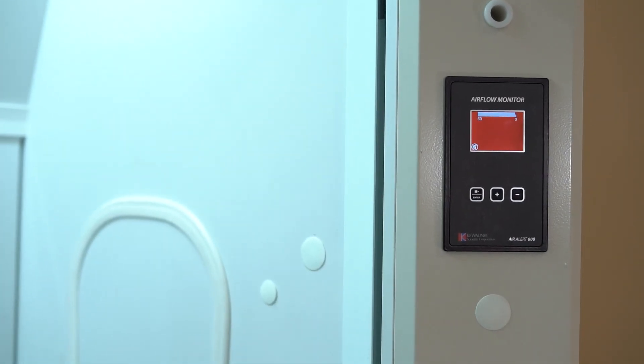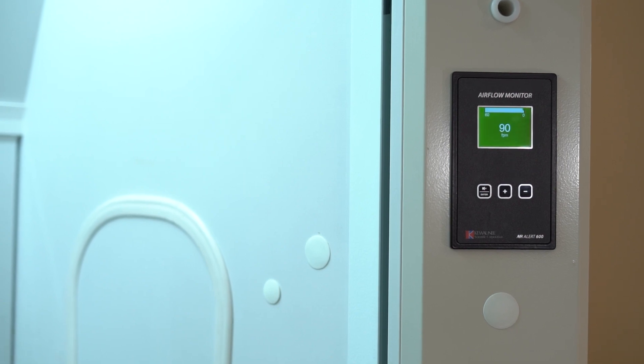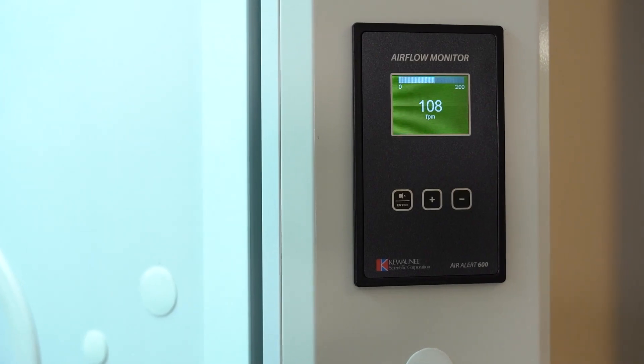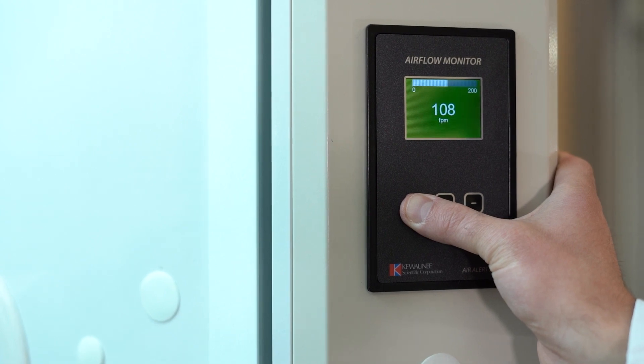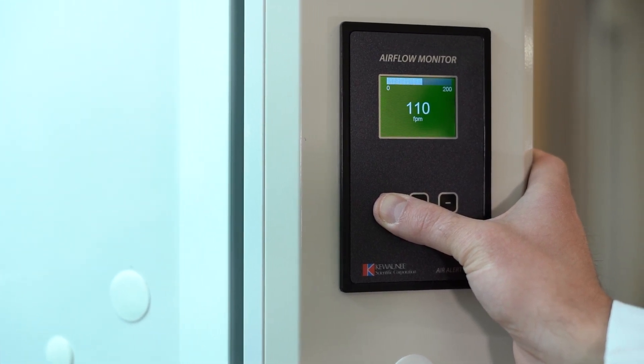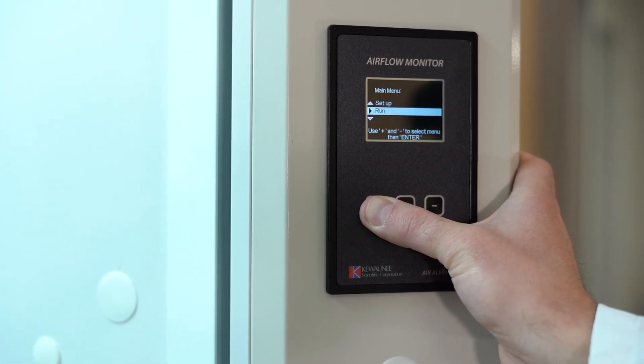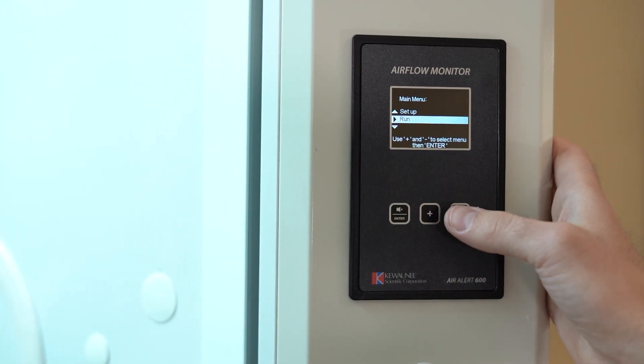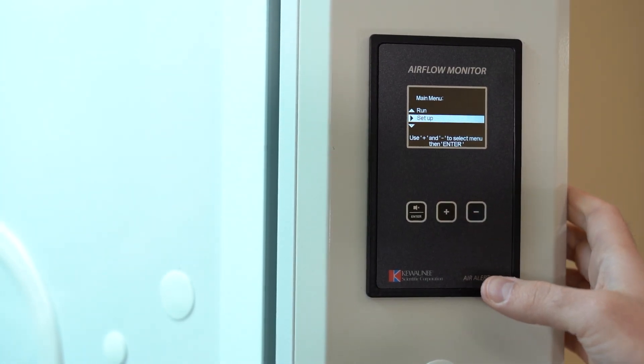If you're authorized to adjust the settings of your fume hood, this is how to enter the menu to adjust settings or complete a calibration. Hold the enter button for 8 seconds. Use the plus or minus buttons to navigate and the enter button to confirm.